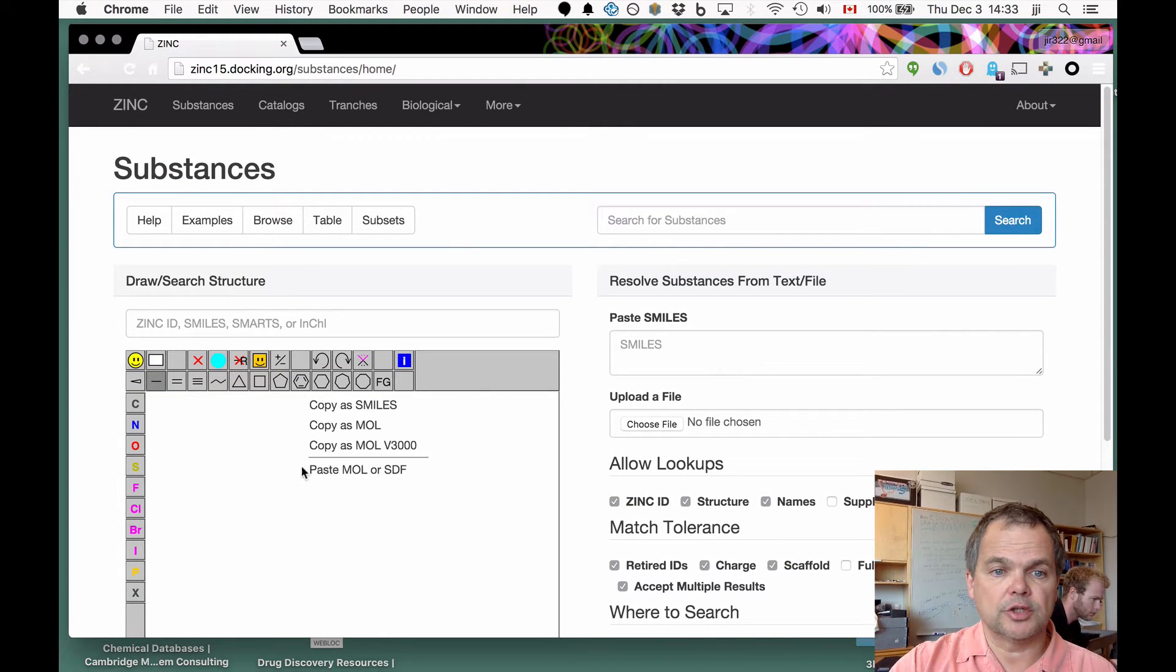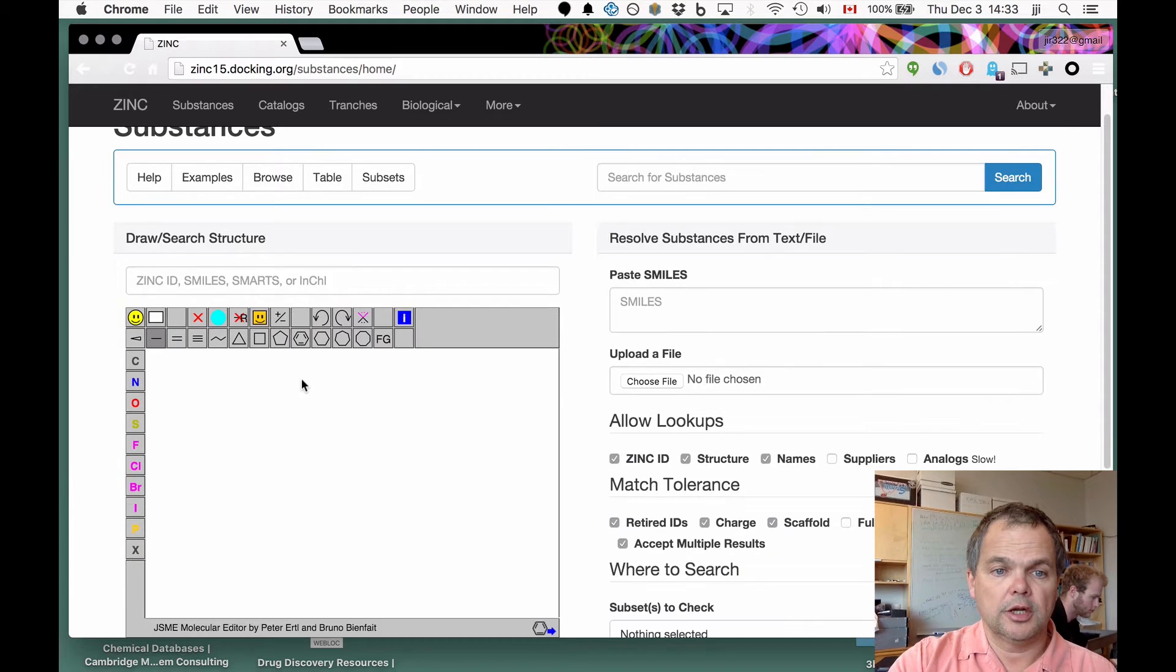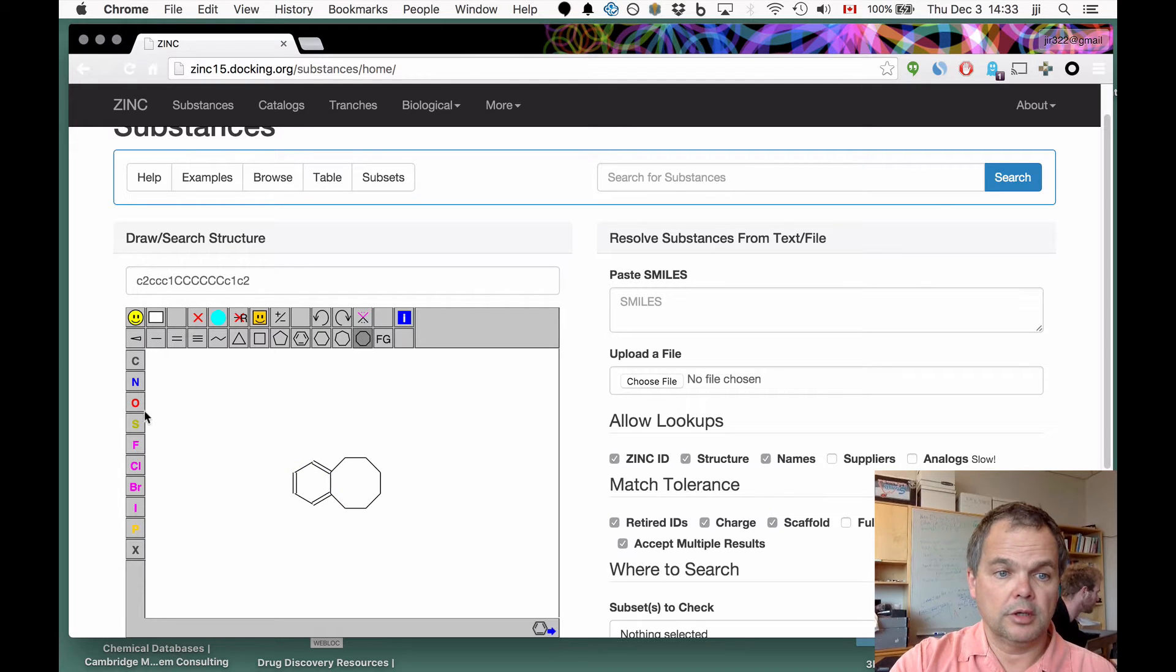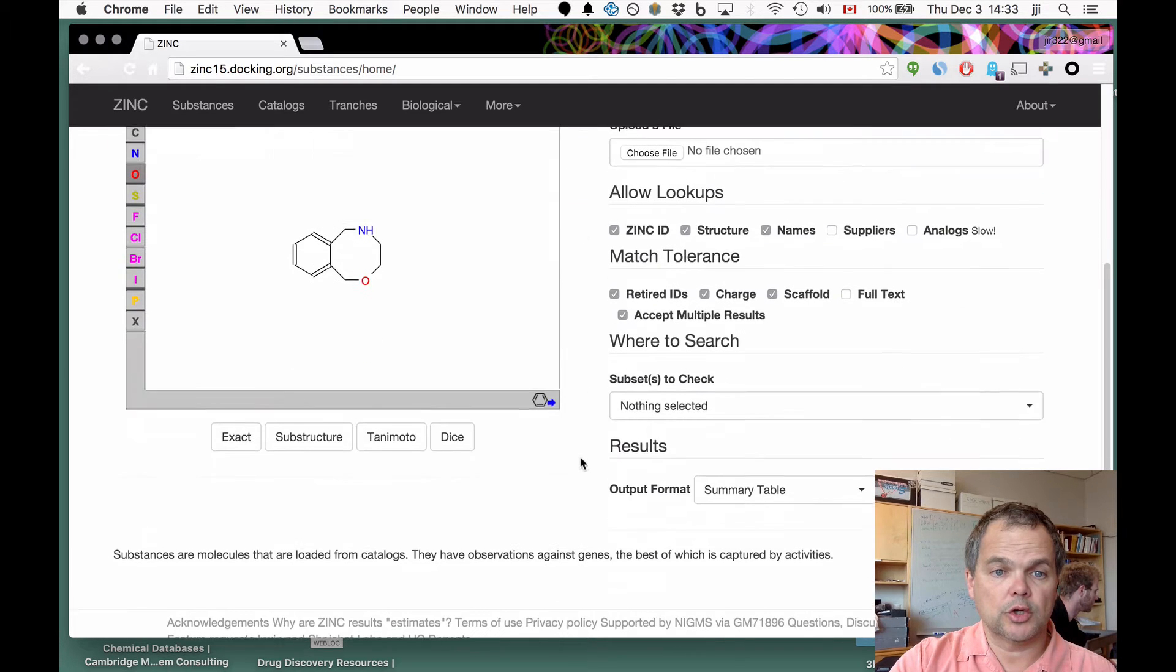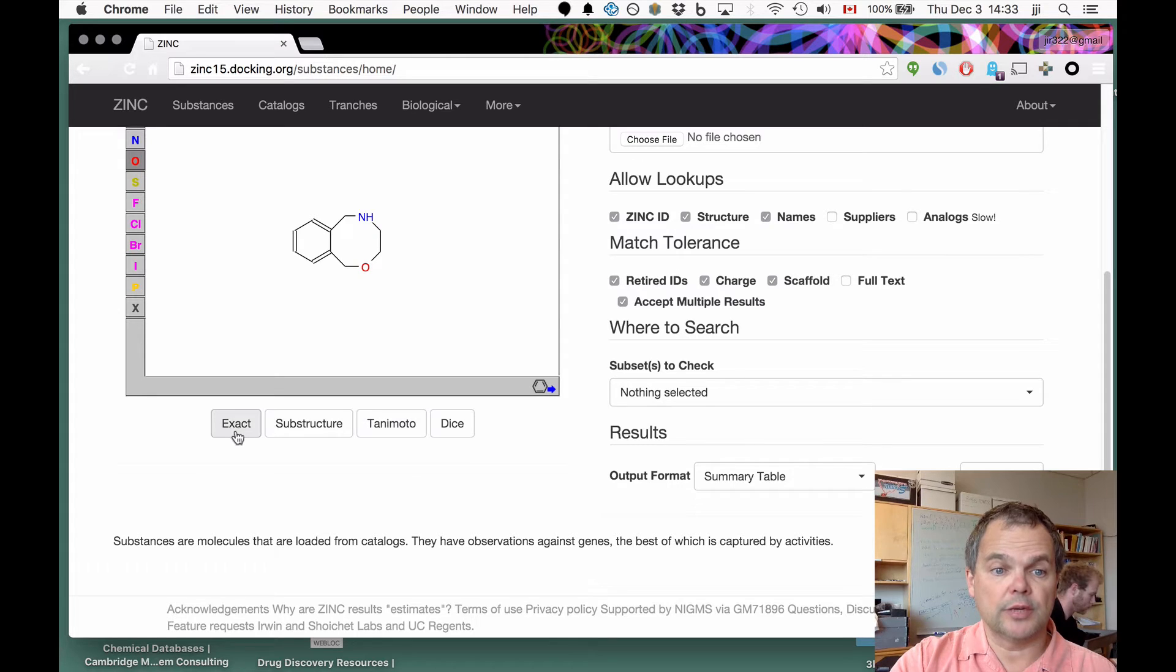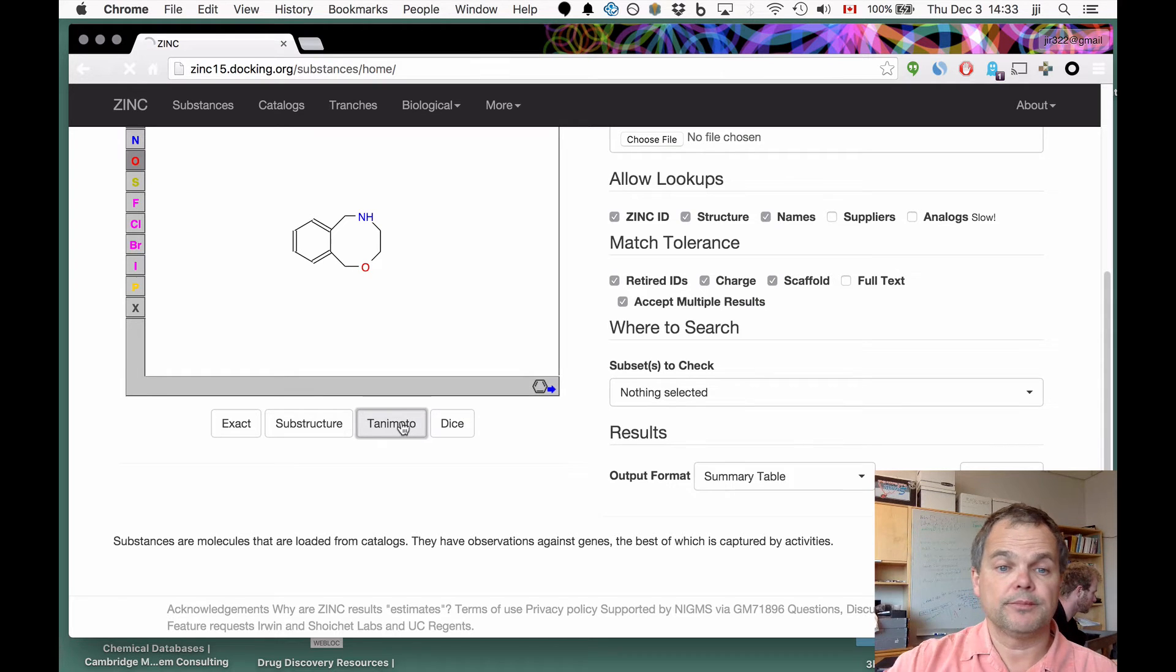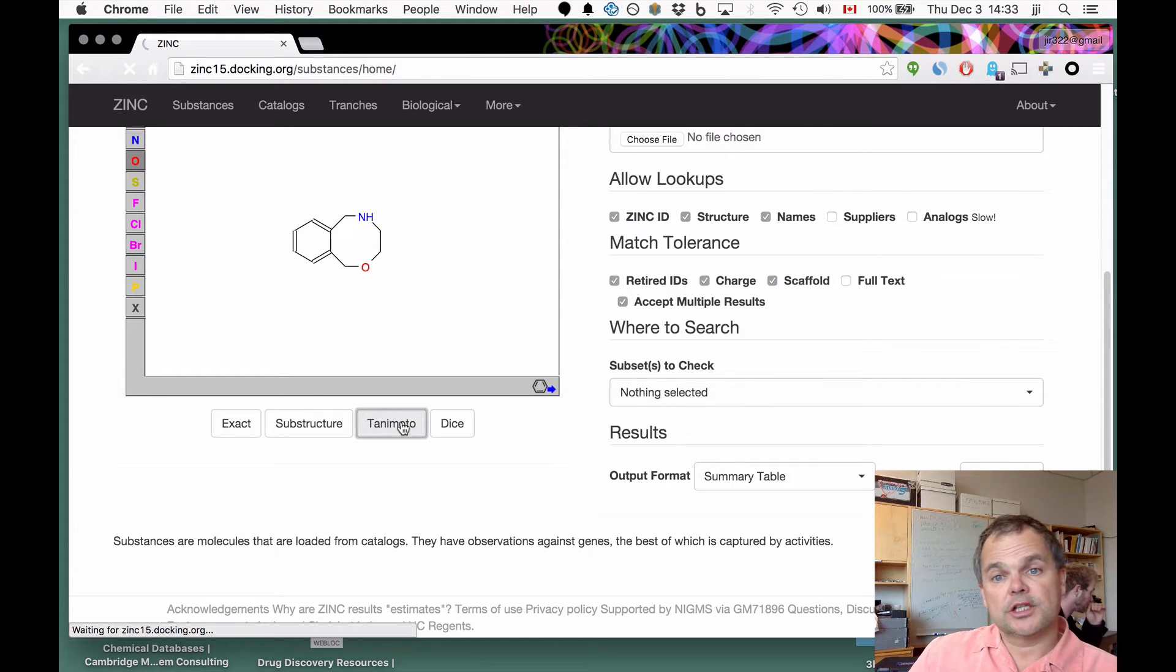If we get started with a drawing, we can simply draw something in here. Let's draw one, two, and then we'll look for something like that. Let's start with a similarity search. There's exact search, substructure search, Tanimoto or Dice are two different kinds of similarity search. We're going to try a similarity search.